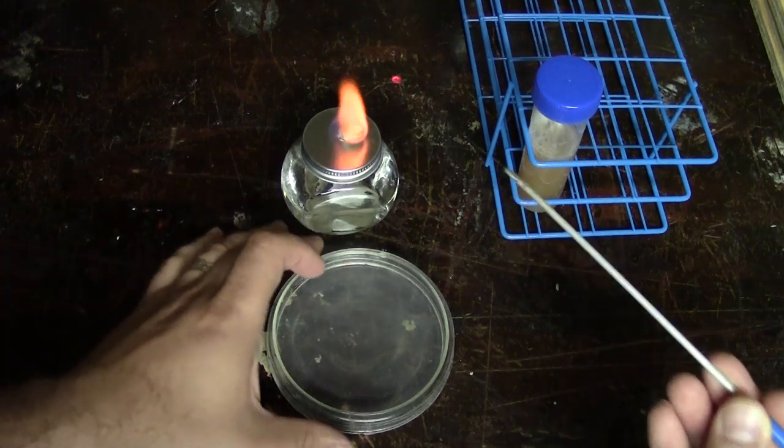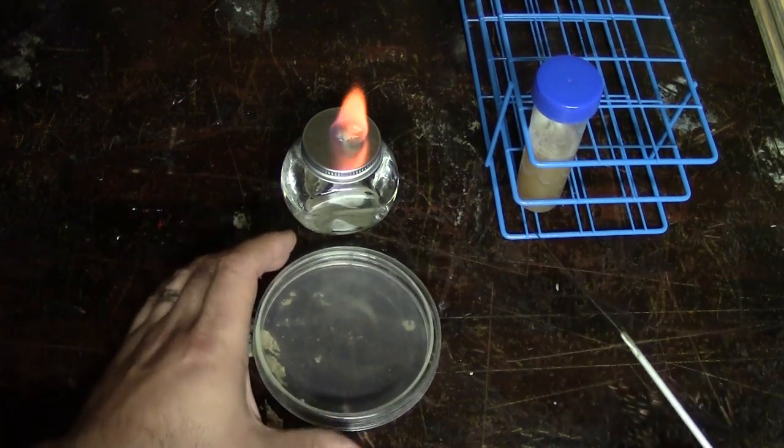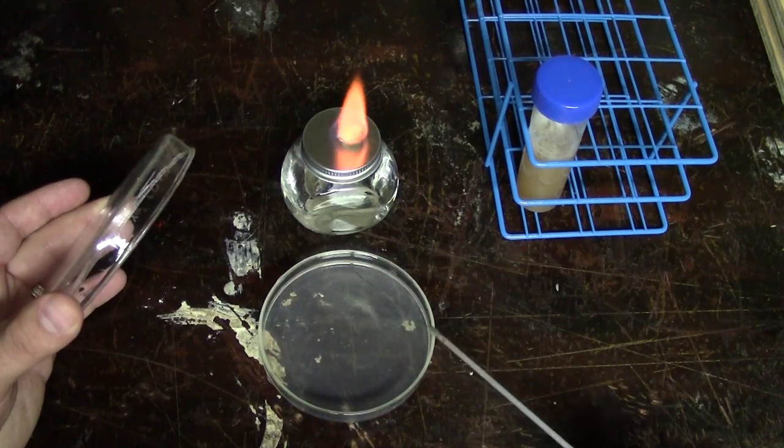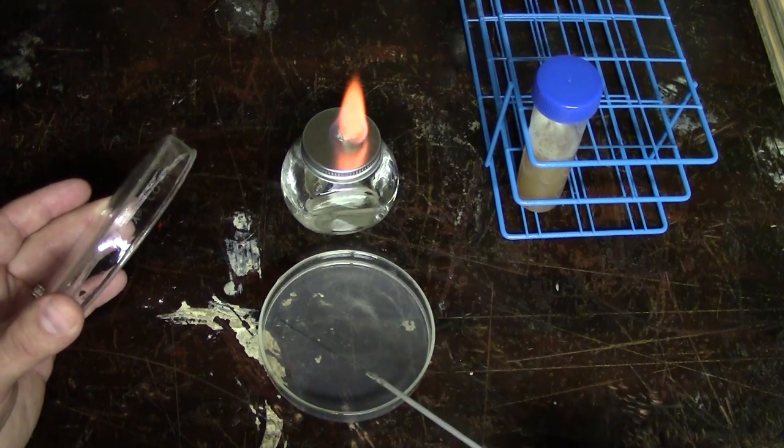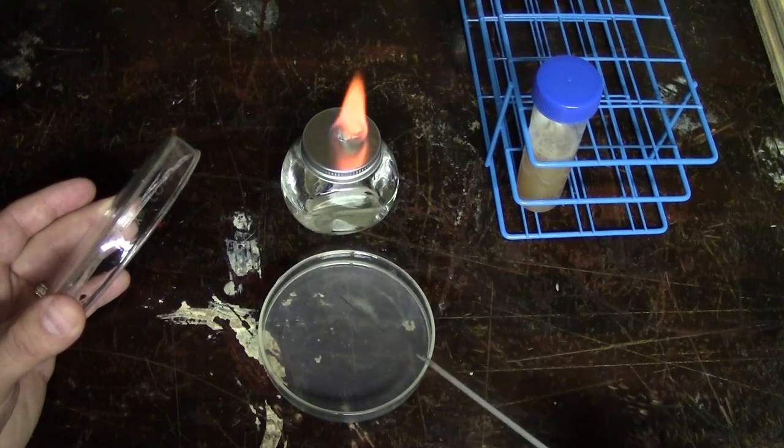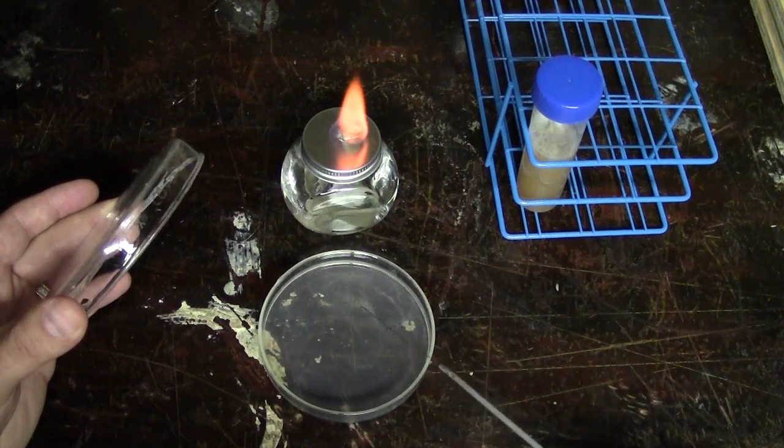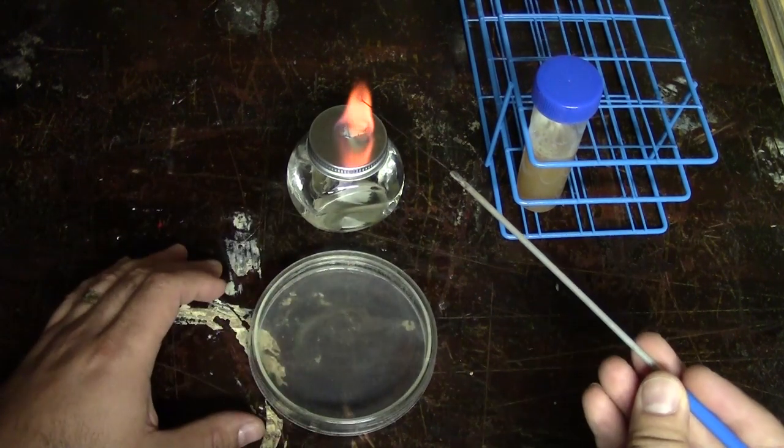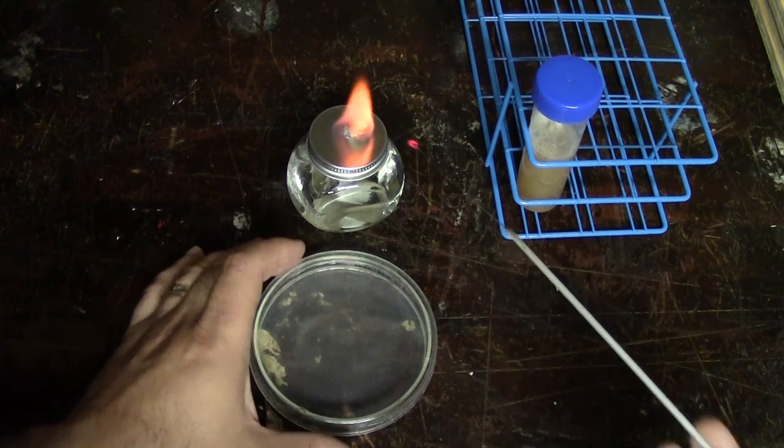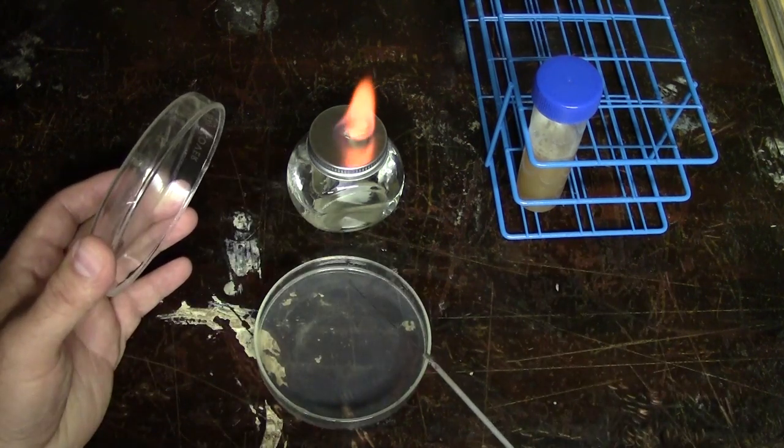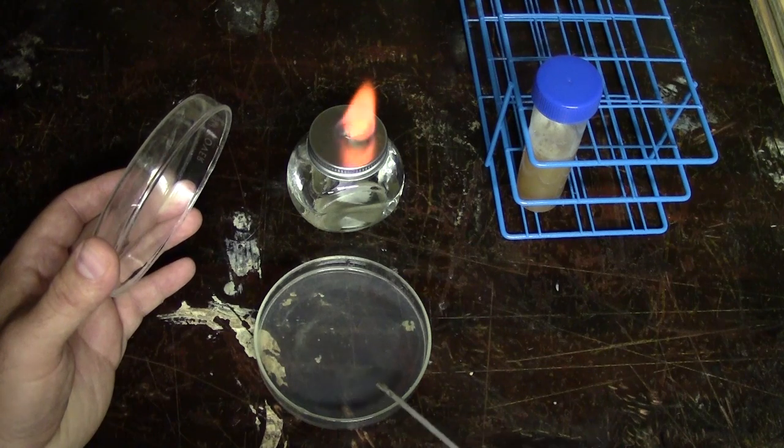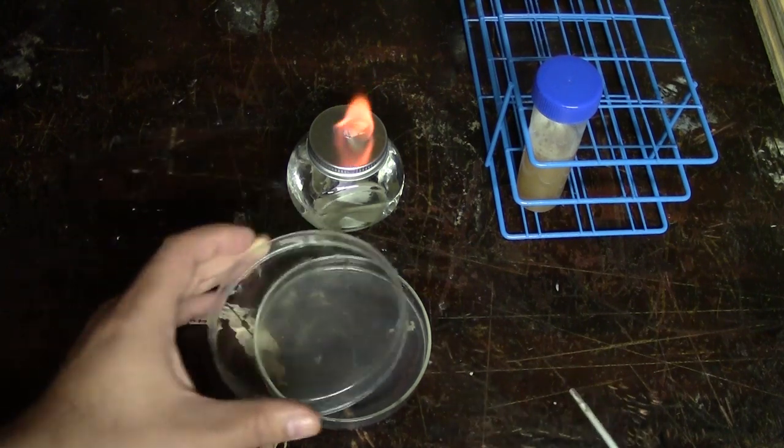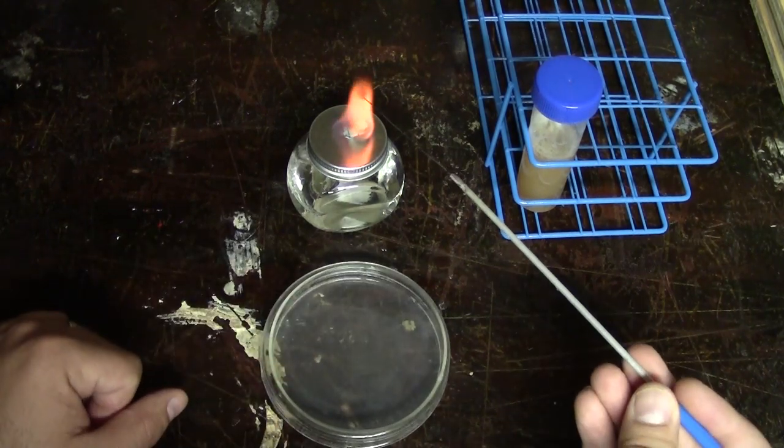We now flame our loop, rotate our dish 90 degrees and now we're going to cool in one corner our loop so you touch the gel that'll cool the loop and now you're going to streak across your first set of streaks once and then again smear out the yeast. We'll turn that again 90 degrees, reheat the loop to sterilize the loop, touch the gel and again cross our last streak, streak it out and we're going to do it a fourth time.